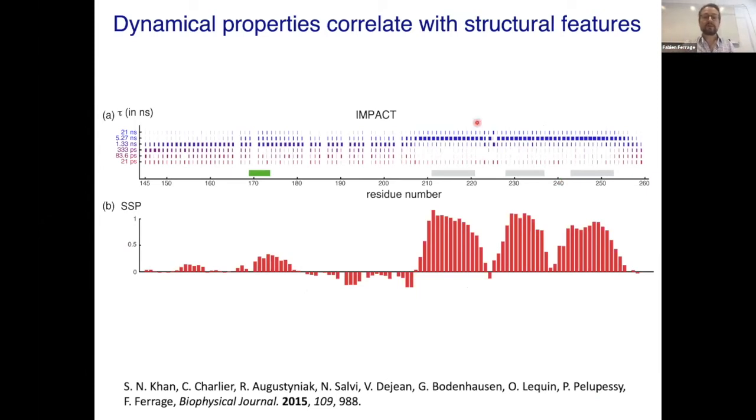I'll show you one nice schematic representation of the results that we call the barcode of dynamics of our protein. The larger the histogram band, the more coefficient is given for a given timescale. What you can see is that the dynamics of the folded domain is highly dominated by the overall tumbling on the low nanosecond timescales. Whereas, as shown also by others like Art Palmer and Martin Blackledge, you have a dominating timescale in the disordered region around 1 nanosecond, with some components, for example in this hexapeptide, where there is more density in the low nanosecond regime. And this correlates very well with the structural features.